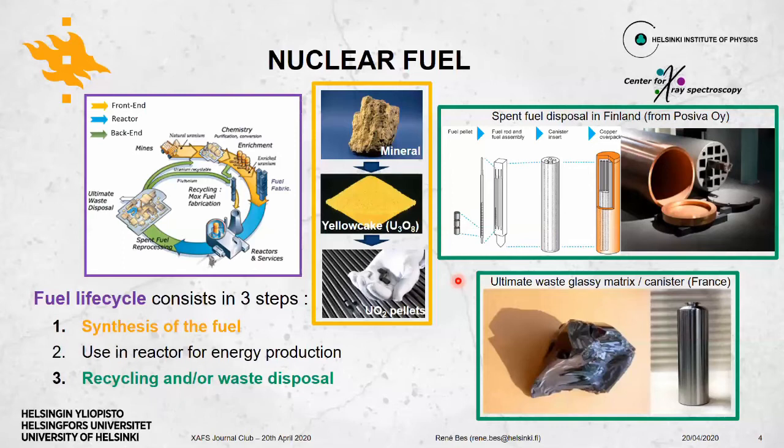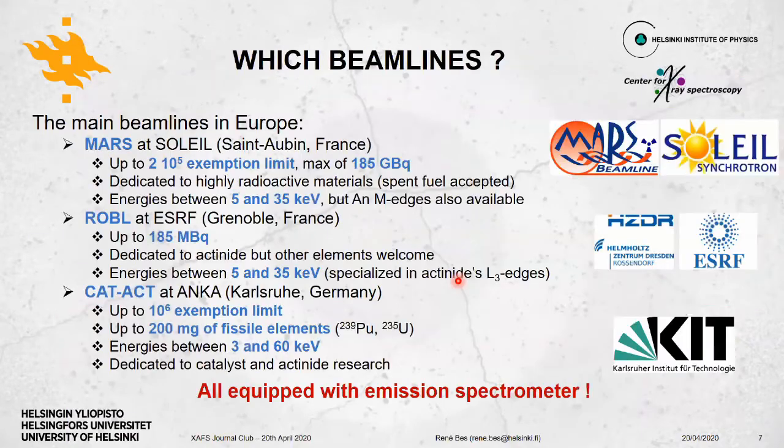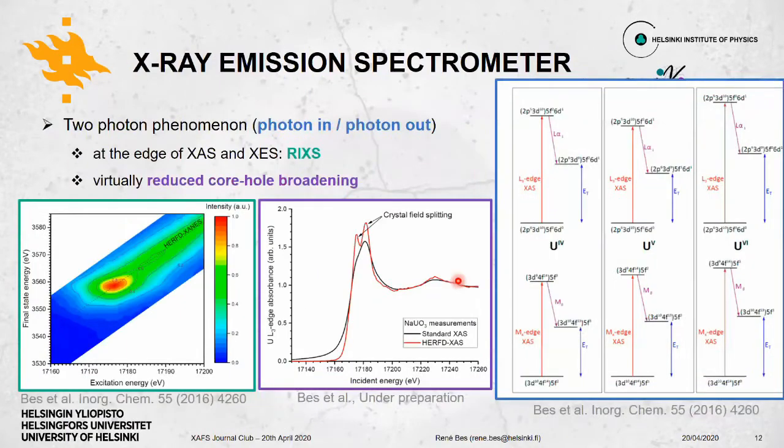The last question is, you showed that wonderful HERFD cut in your last slide before the questions, where you were able to see the crystal field. Yeah, that one with the crystal field splitting. And the question was whether instead of doing HERFD in this kind of system, you could have tried deconvolution of the core hole lifetime, and whether you think that's worth pursuing.